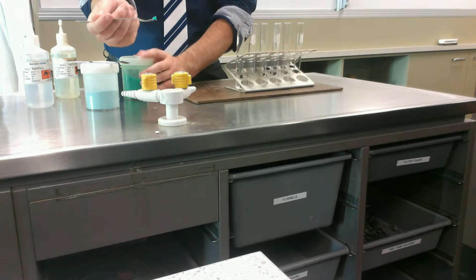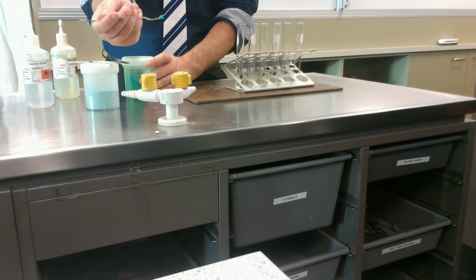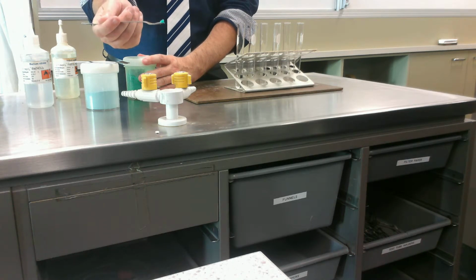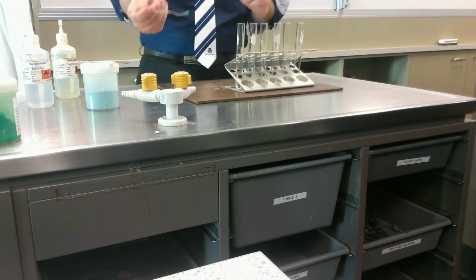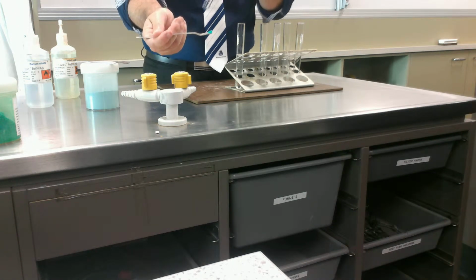Turquoise. Yeah, turquoise, good description. So it's sort of a greeny, bluey, or bluey, greeny salt, isn't it? It looks a bit like salt with food colouring in it, doesn't it? Is that a fair comment? Yeah. Cool, okay. So what we're going to do is see what happens when I add that to water. So we've got a sort of greeny salt, a greeny crystal.